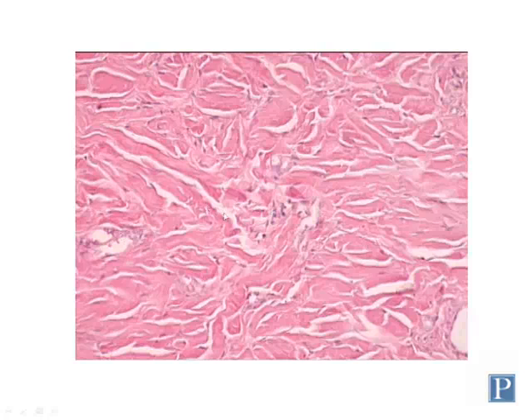It's dense because, as you can see, the matrix is just packed with lots and lots of collagen fibers here, unlike the loose connective tissue, in which there are not nearly as many fibers and there's a lot more ground substance. This has less ground substance and a greater proportion of collagen fibers. So that's why it gets the name dense. It's irregular because you can see these collagen fibers, which are found in these thick bands here, have a very irregular shape to them, and they're going in every which direction. So they're irregularly arranged. That's why this type of tissue gets its name.